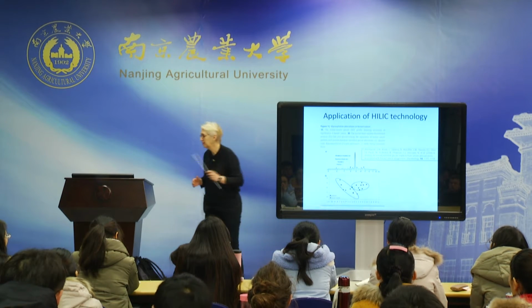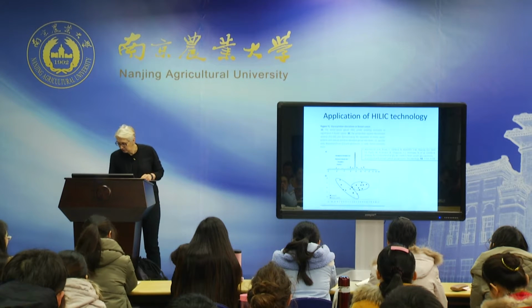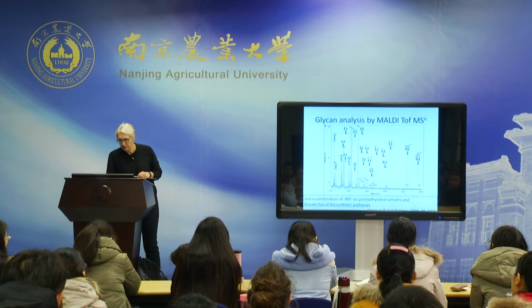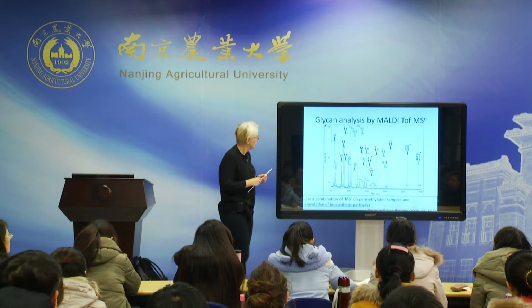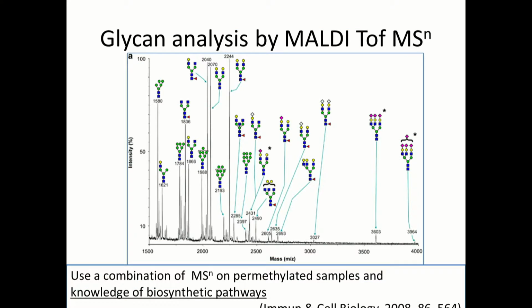But certainly in cancer, I think the glycosylation pattern on these cells really, really changes, and analysis of glycans might provide good biomarkers. There are other methods, using similar approaches but also using mass spectrometry. So this is just the second method I want to introduce. Unfortunately, this comes from the Dell group at Imperial College in London. They are really the leading group in the world to analyze glycans by MALDI-TOF mass spectrometry.